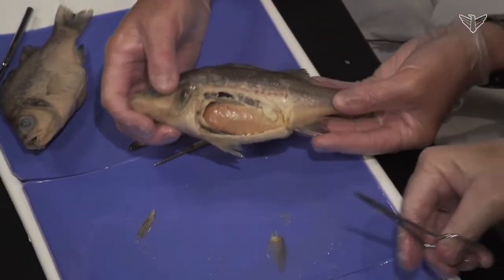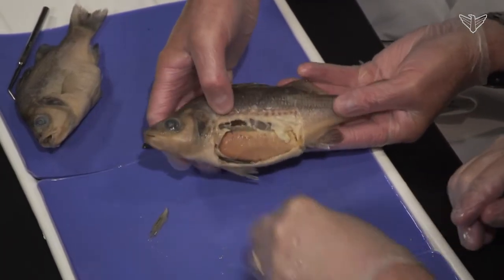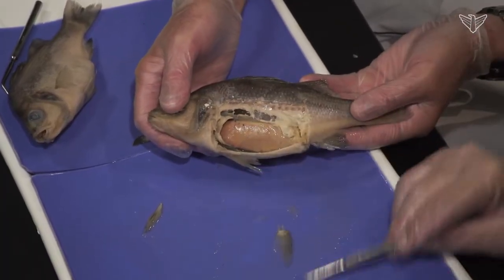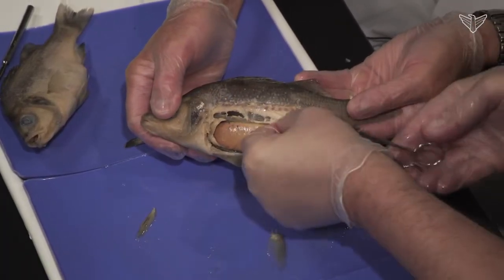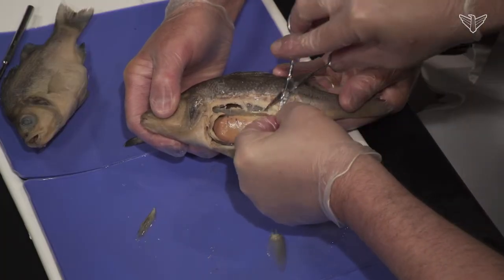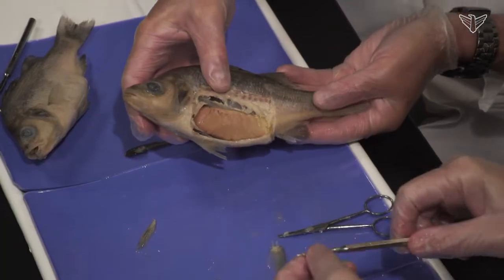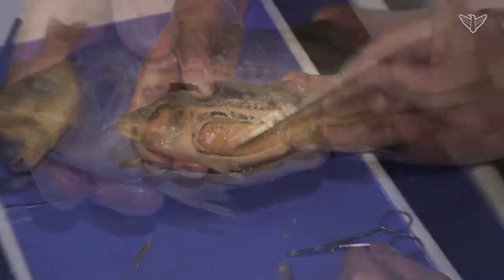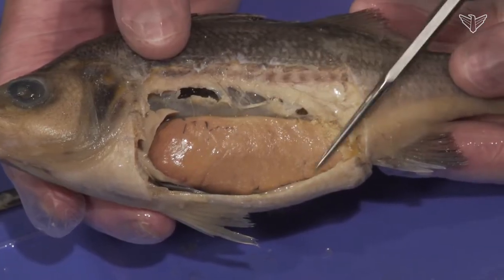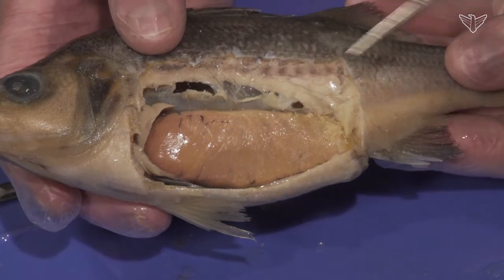This would normally be laying flat, but we're trying to show it to the camera. You can see — this is definitely a female. A lot of the body cavity, probably two thirds of it, is taken up by this large gonad, the ovary, which is full of eggs.